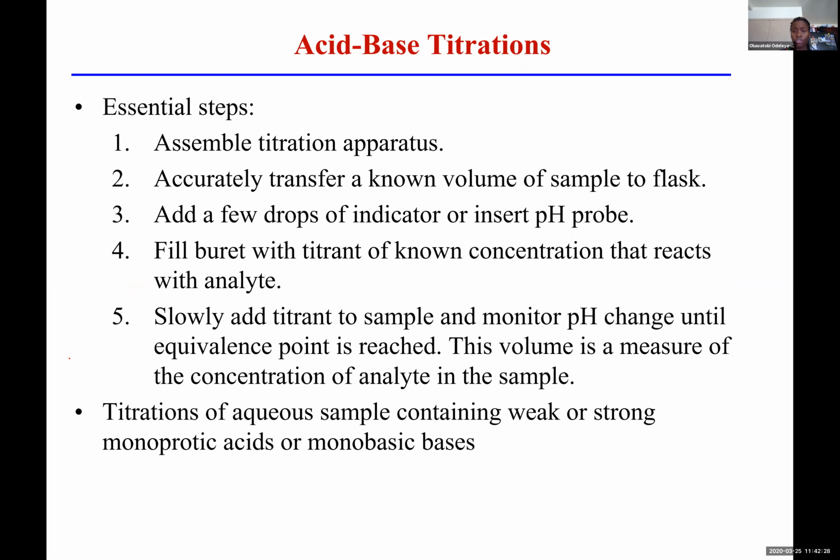So when we talk about titration, I'm not going to spend too much time on this. I will post a video that shows how titration happens, but essentially if you're in lab, you would get what you needed, make sure that you have your volume of the substance titrated in your Erlenmeyer flask, put your stuff in the burette that you're going to do your titrant, and essentially just add. You have to add an indicator as well that shows the color when you reach that point, the equivalence point. Essentially just add your titrant till you hit that point. I will post a video later showing how to do that.